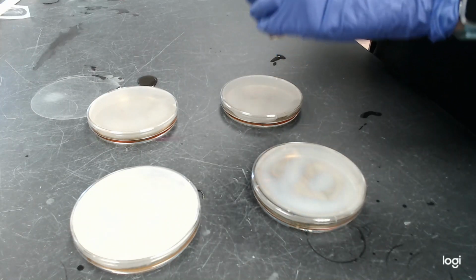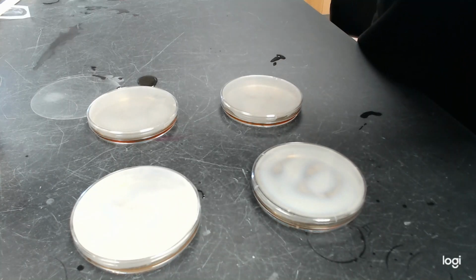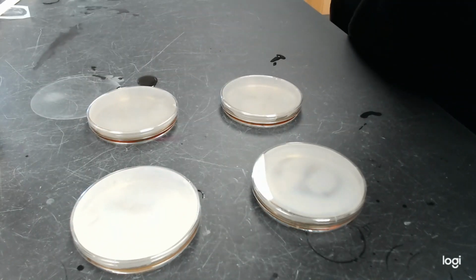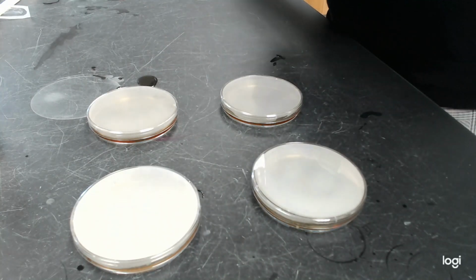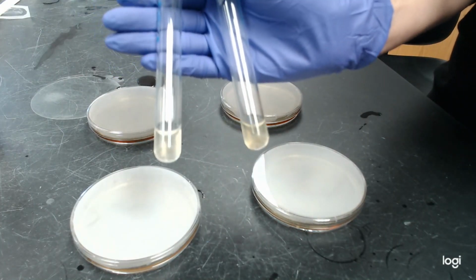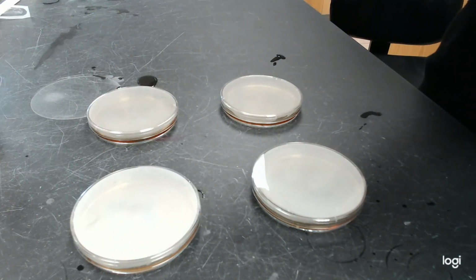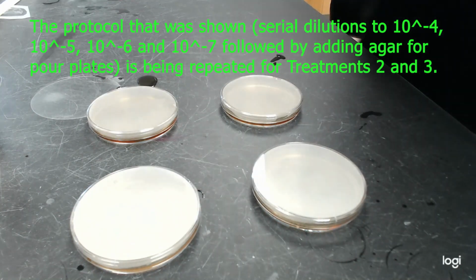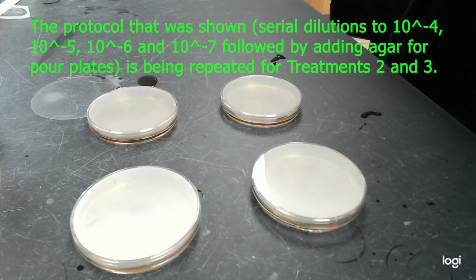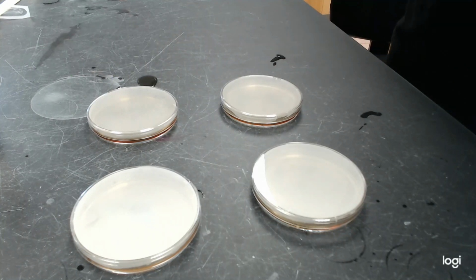The test tube that has the E. coli and the nutrient broth in it has gone into the 37-degree water bath, where it will be for 2 hours. Now I'm going to do the same steps for these other 2 test tubes, and I'm not going to record this. I'm going to do serial dilutions and then make plates at the 10 to the minus 4, 10 to the minus 5, 10 to the minus 6, and 10 to the minus 7 dilutions, and then put those test tubes in the water bath for 2 hours.